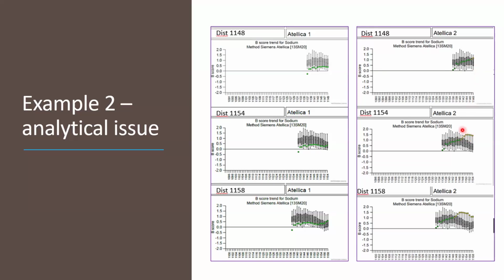Okay, so what have we done? We've done the non-conformance report and started the investigation. All the samples have been rerun on both lines, and similar results were obtained as in the first run.